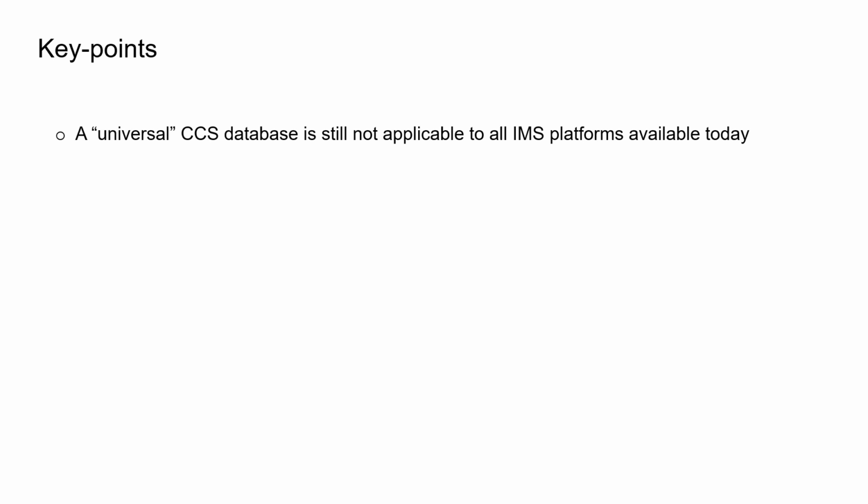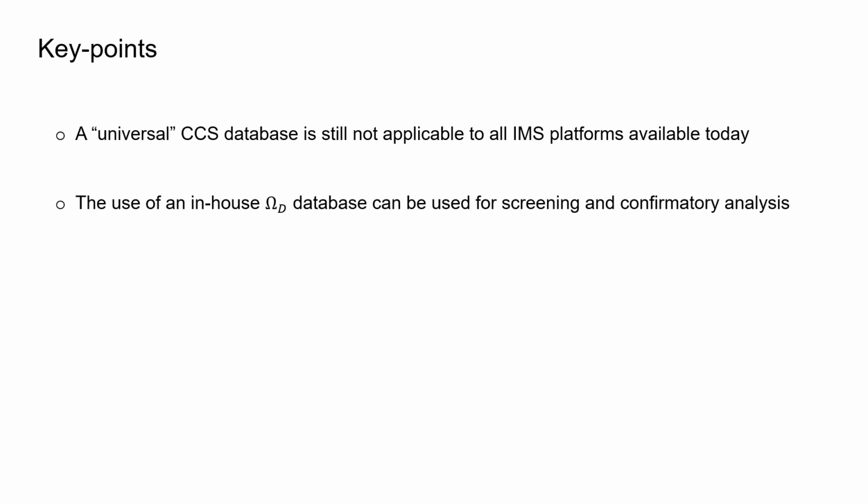A universal database of CCS is still not achievable for all IMS platforms available today because deviation exceeds 2%. Although this does not prevent us from building an in-house CCS database, validating it, and using it for screening and confirmatory analysis if we prove the performance is good enough, which means if we can achieve good precision.